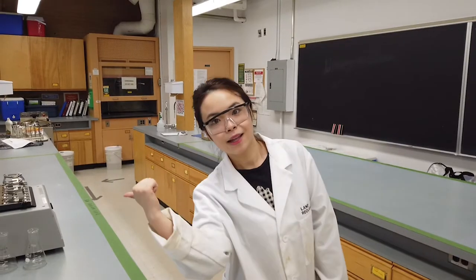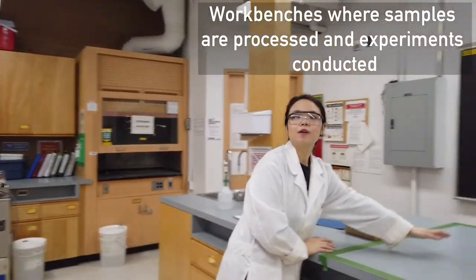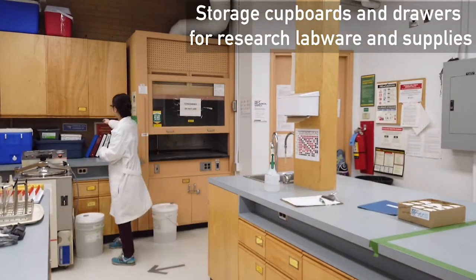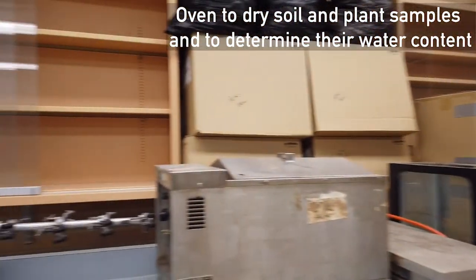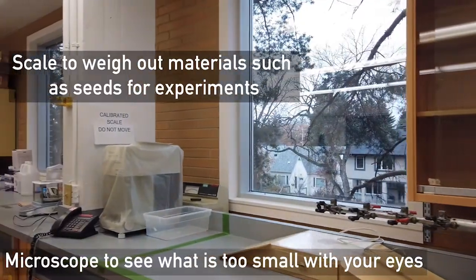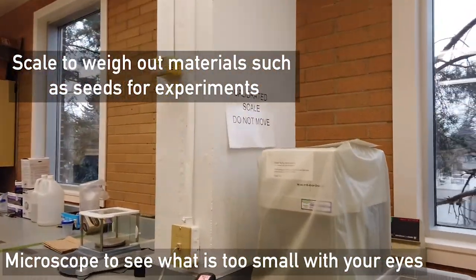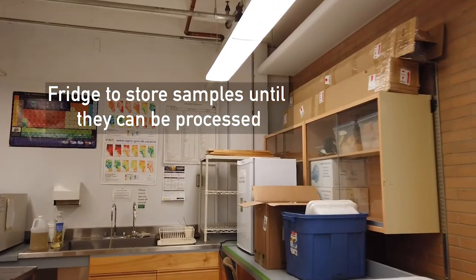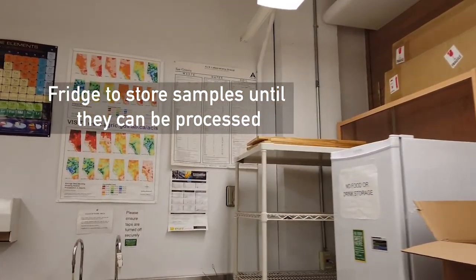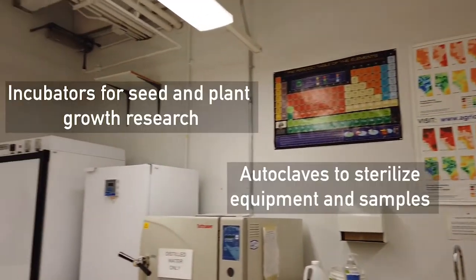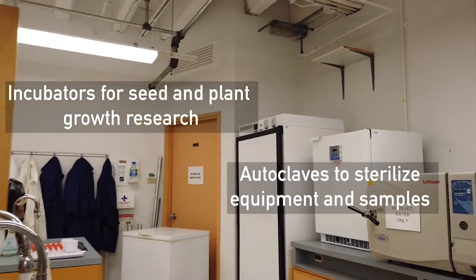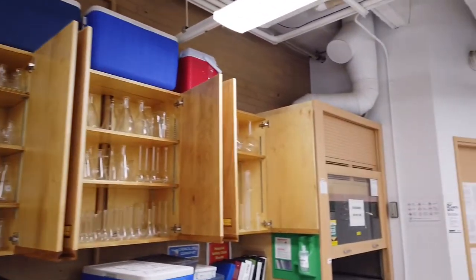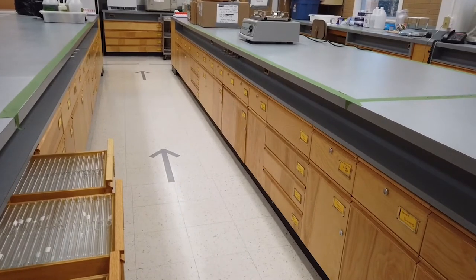Now let's explore the lab. We have many things here like work benches, sinks, storage bags, oven, microscope, fridge, incubators. We have lots of storage of things from volumetric flasks to beakers to test tubes and more. Chemicals are locked up in these cupboards.